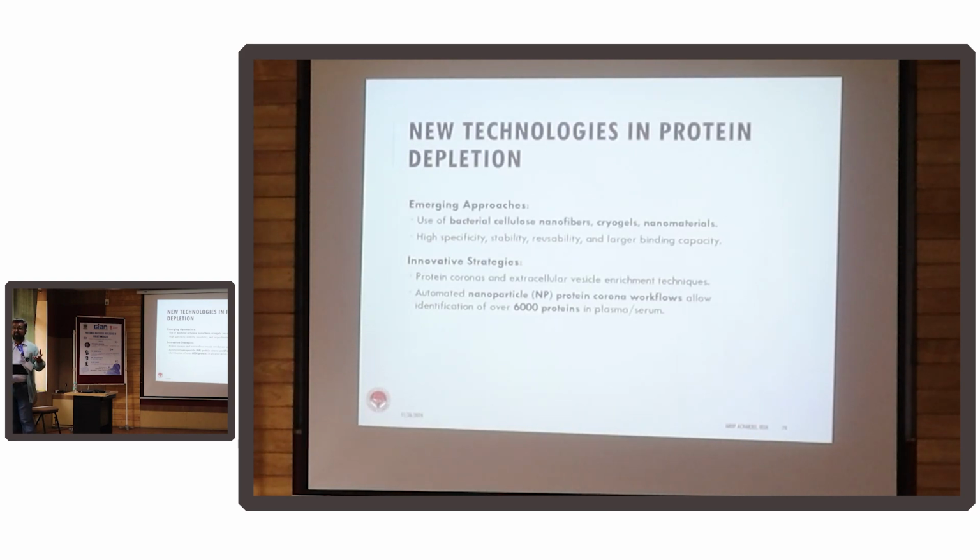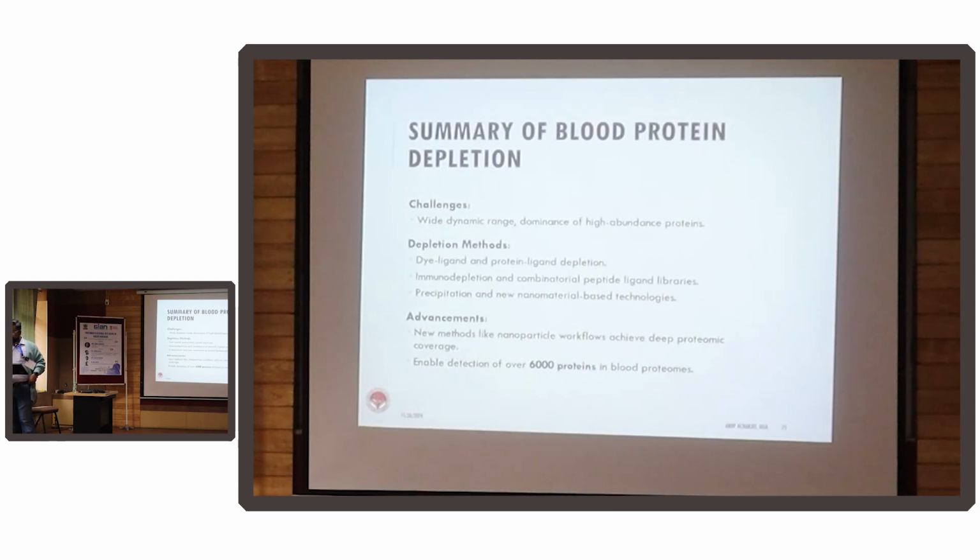Look for access. Like in our own lab, we wanted to use Protify in my lab at BHU, but we could not because of some challenges in the supply chain. Okay? So this is in summary about blood protein depletion.